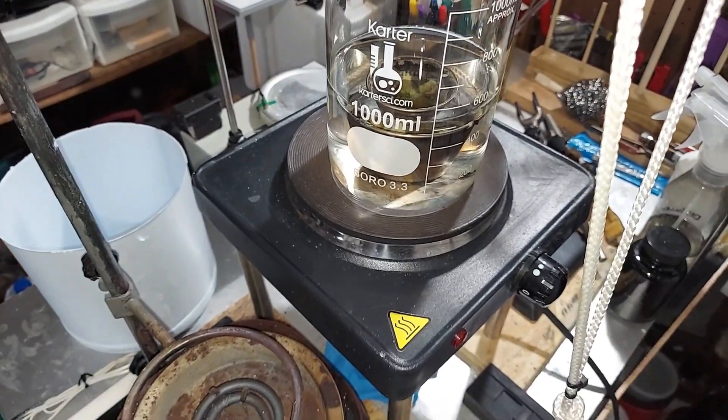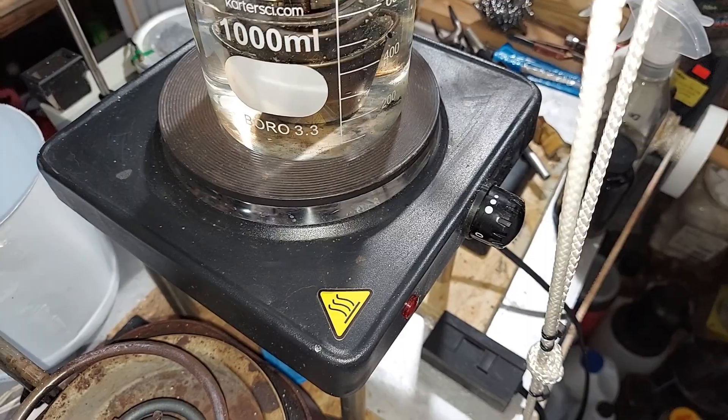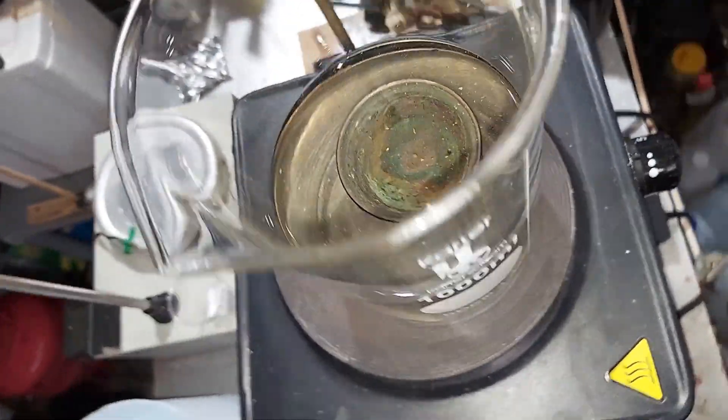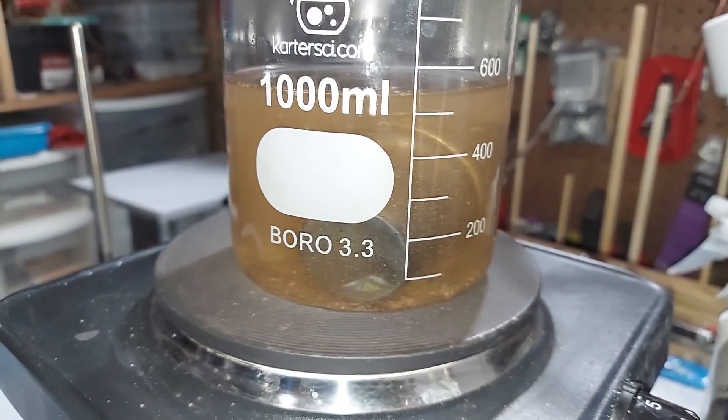I'm going to add it here to this beaker of water. I've done two of them, so I might as well make the most of it — get that one in there. There we go, you can see them in there.